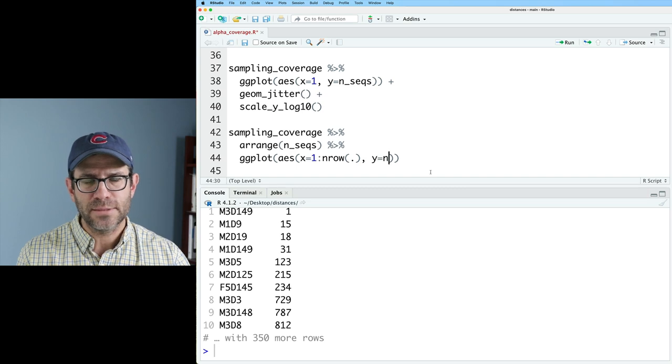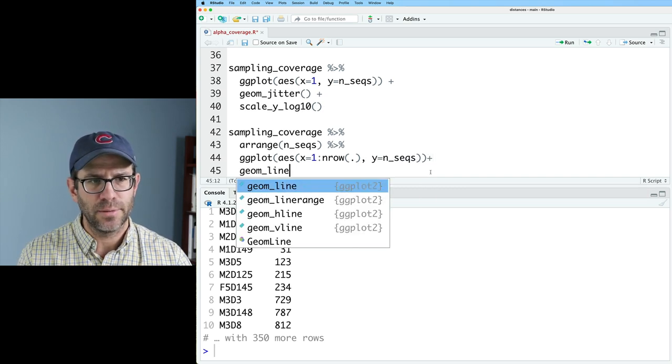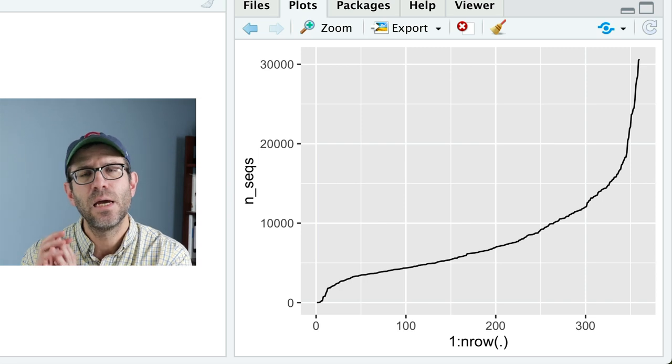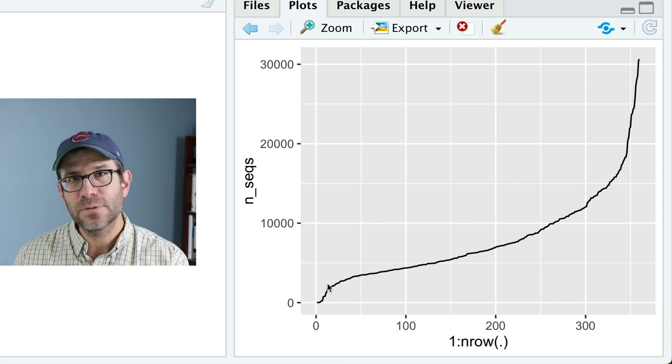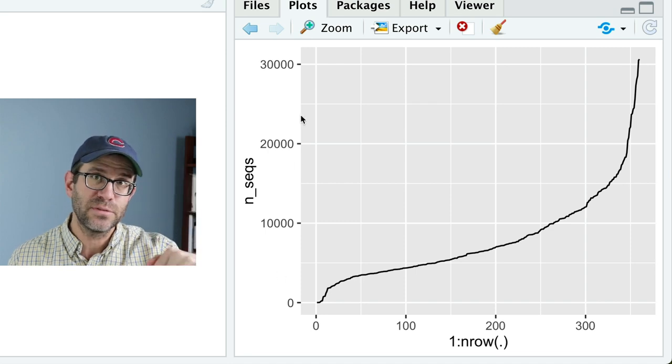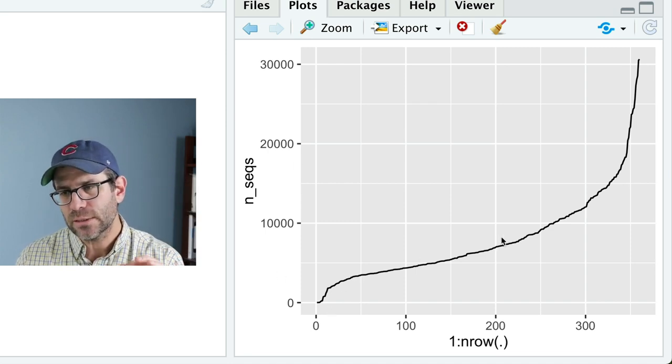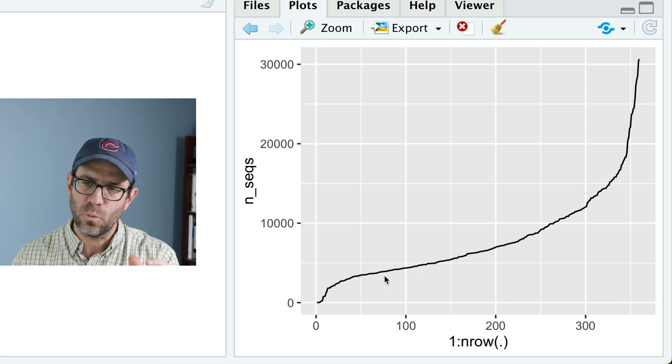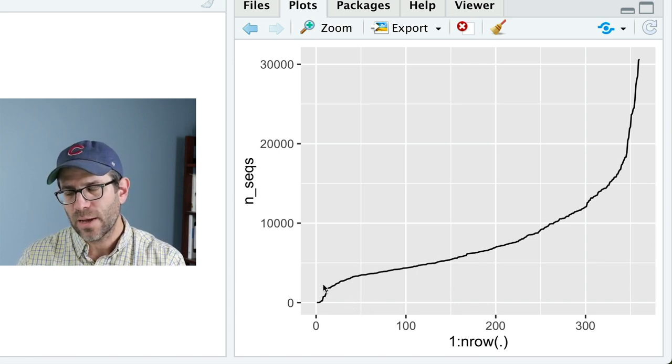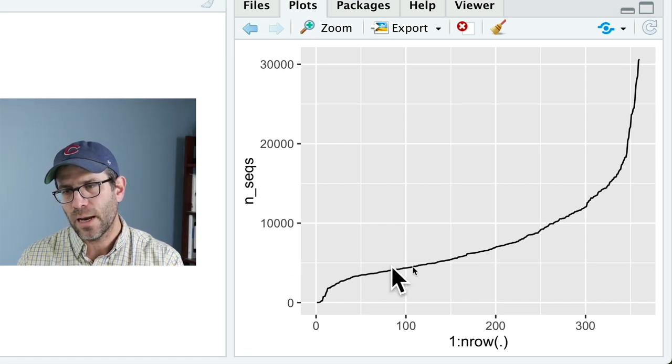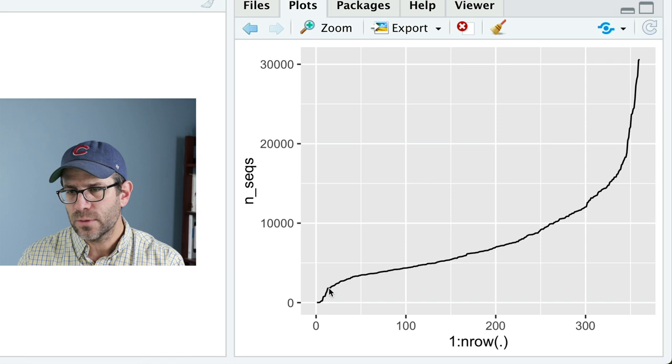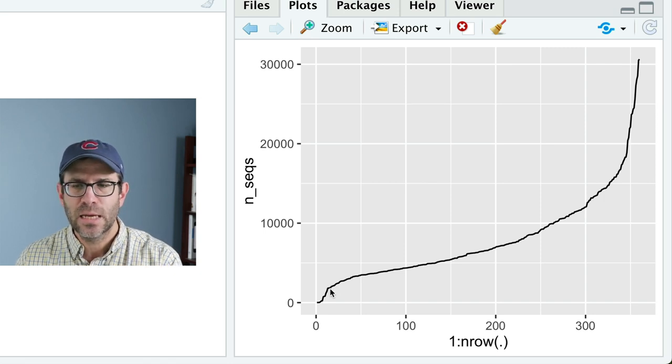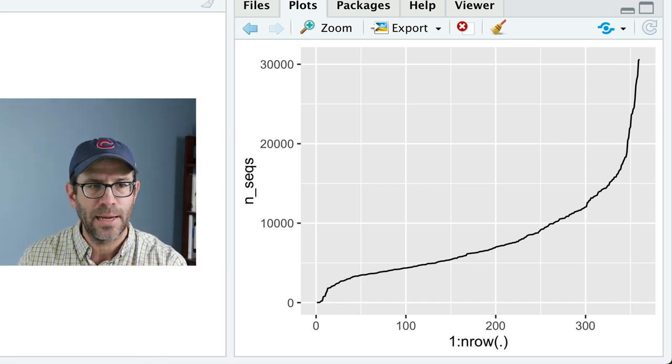And on the y-axis, I'll put nseqs, and I'll do geom line. And so we now see in this plot, the number of samples that I have on the x-axis and the number of sequences in each of those samples. And so you can look at this curve and see kind of where most of the samples lie. And so I'm feeling like right at this minor grid line, it's about 5,000. And right around here, whatever that shoulder is, is probably right around where I want to make my cut.